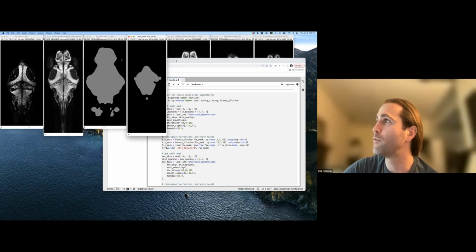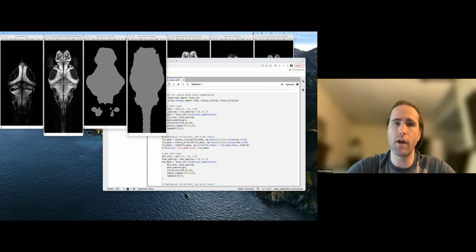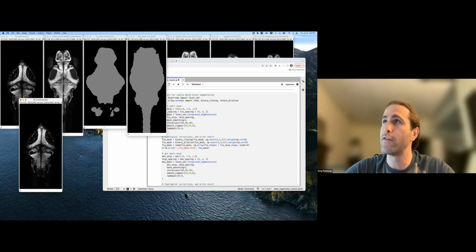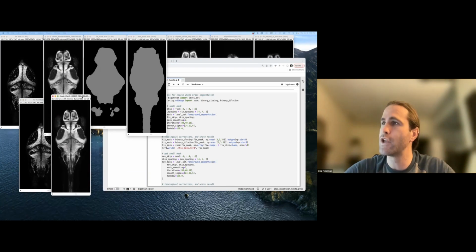So to speed things up a little bit, I already have these results computed, and this is what they look like. And really quickly, I'm going to superimpose them on top of the images that they correspond to so we can visually inspect that they actually look good. So here's a copy of the fixed image. And here's a copy of the Atlas channel.